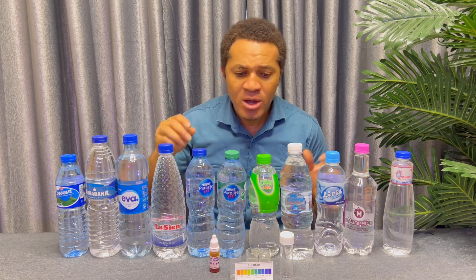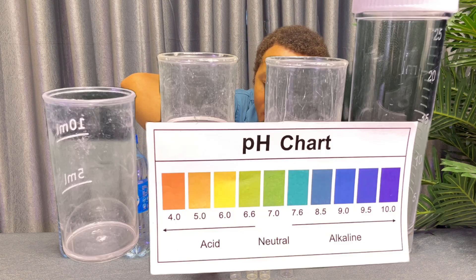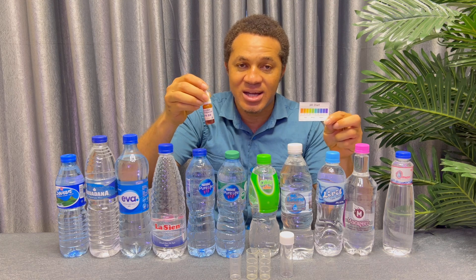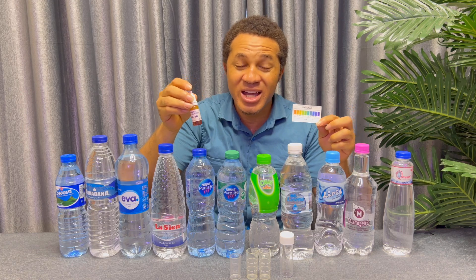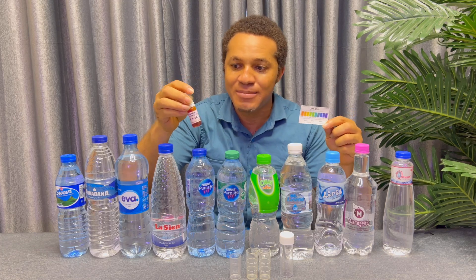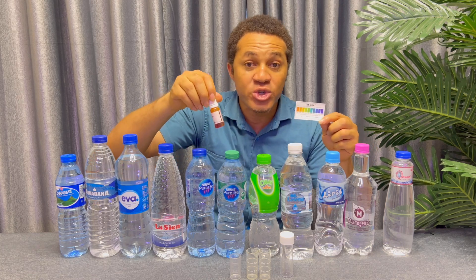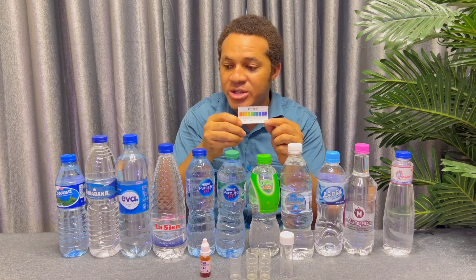Before us here we have the pH charts that we are going to use to indicate results after we use our liquid tester. For this test I decided to use the liquid tester because I prefer it to the electronic tester. For the electronic tester, if there is any fault it can give you error codes which might affect your testing. But for this liquid tester, if it is red it is red, if it is purple it will totally show you it is purple.